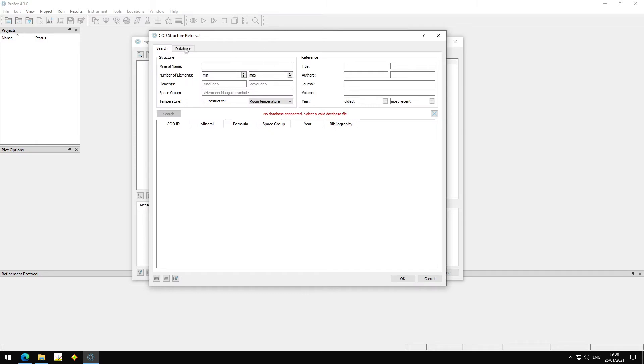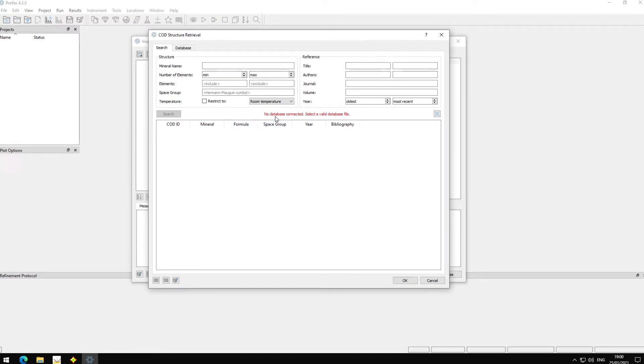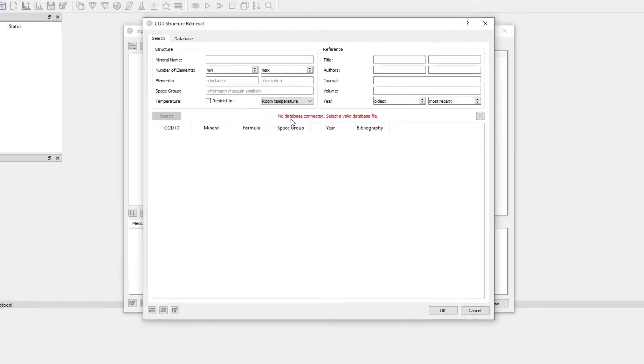This opens a new dialog, the COD Structure Retrieval. And when we open it for the first time, it says no database connected, select a valid database file.